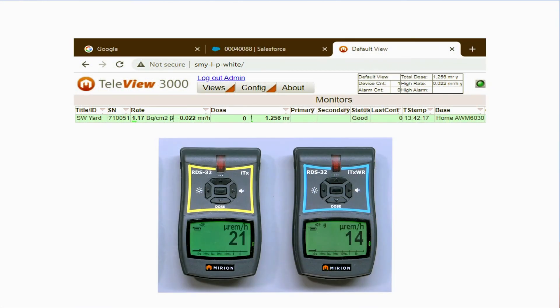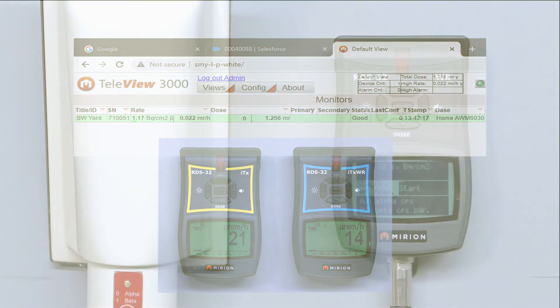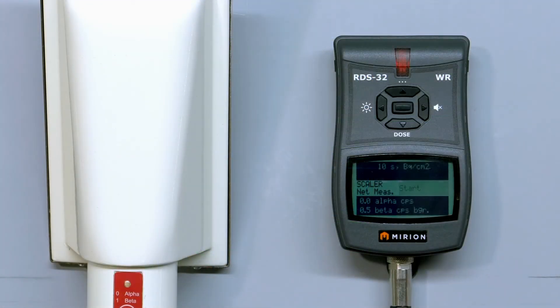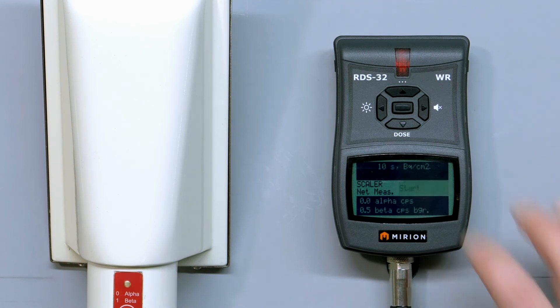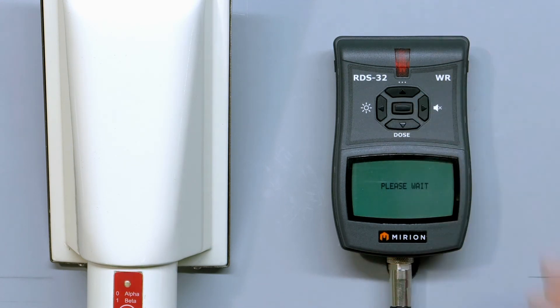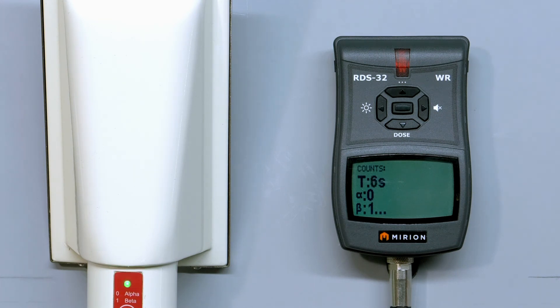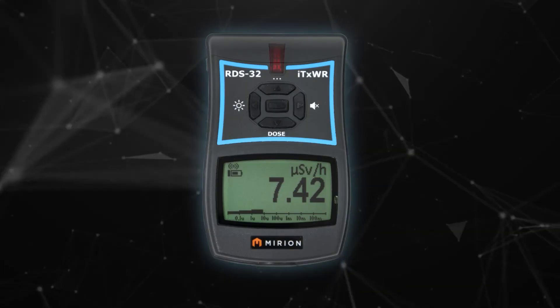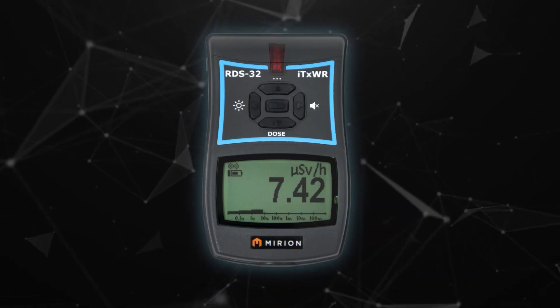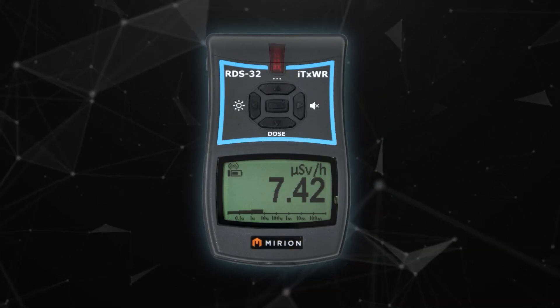Don't forget, with the ITX version, you are sending the data of both the RDS and the probe. One final reminder if you did not catch it mentioned earlier: all our contamination probes can be used in scalar mode to provide net counts, offering other options to the Easy Count. We hope you enjoyed our RDS32 introduction.